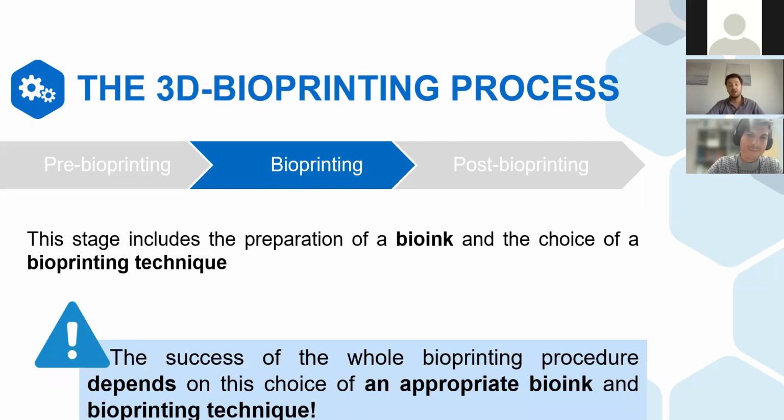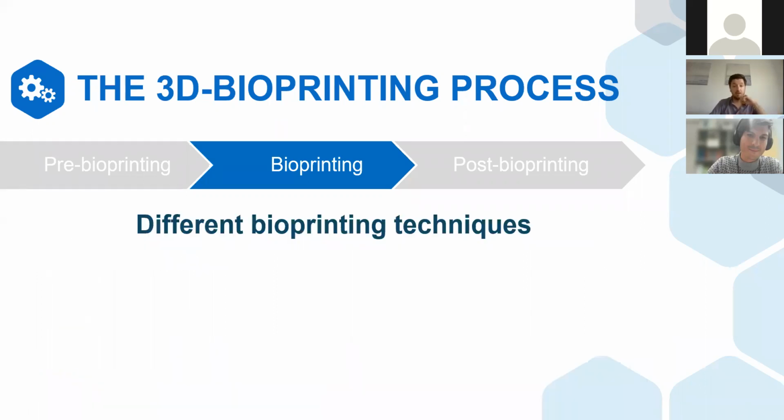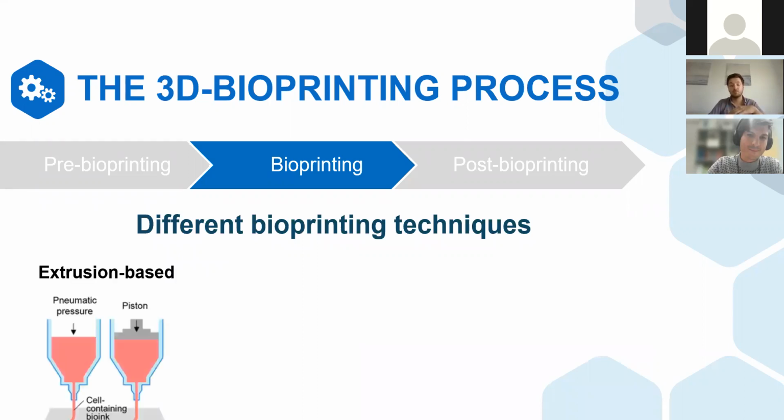As you may see, the success of the whole bioprinting procedure will depend on the choice of an appropriate bioink and an appropriate bioprinting technique. An appropriate bioink for what we want to build, and an appropriate bioprinting technique that considers what bioink we are using. I won't dive too deep on the different bioprinting techniques.